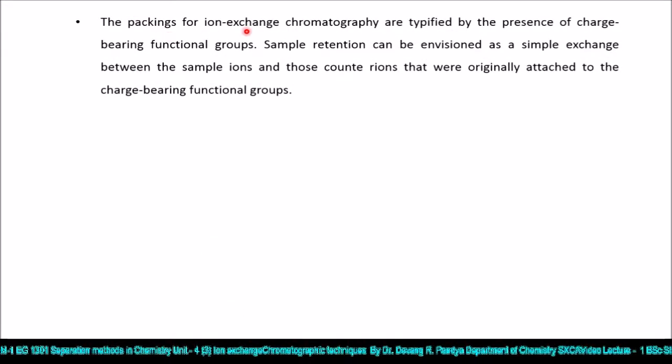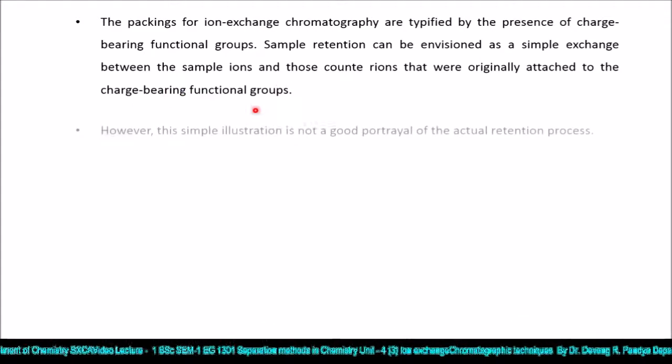The packings for ion exchange chromatography are typified by the presence of charge-bearing functional groups. Sample retention can be envisioned as a simple exchange between the sample ions and those counter ions that were originally attached to the charge-bearing functional groups.